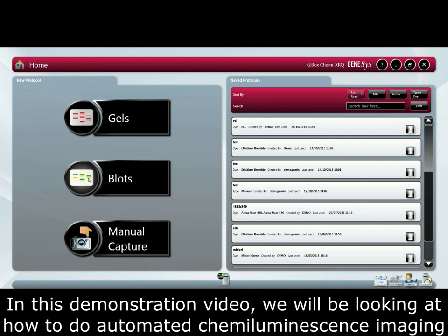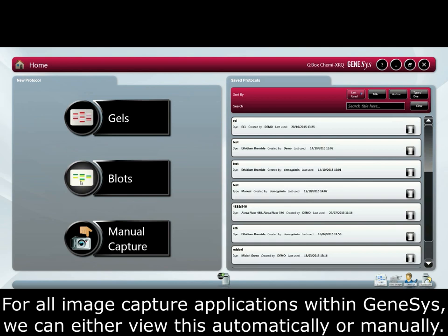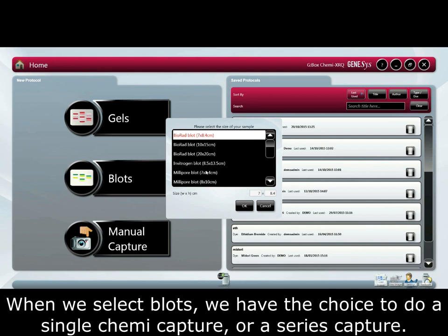In this demonstration video, we will be looking at how to do automated chemiluminescence imaging in Genesys. For all image capture applications within Genesys, we can either do this automatically or manually. When we select blots, we have the choice of doing a single chemi capture or a series capture.